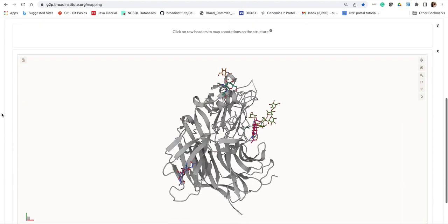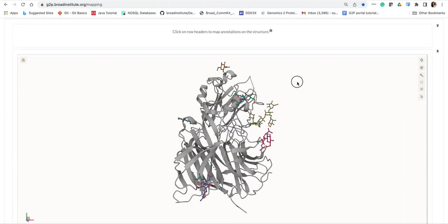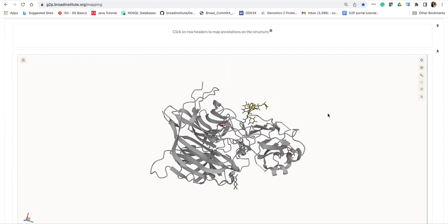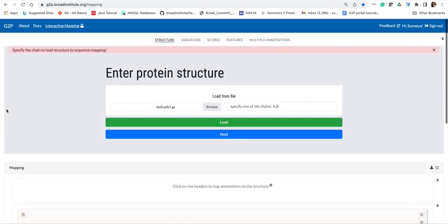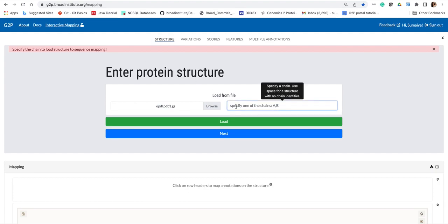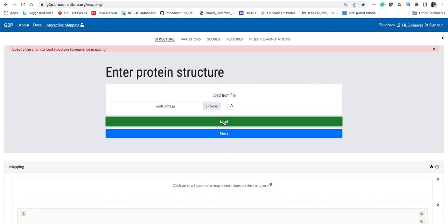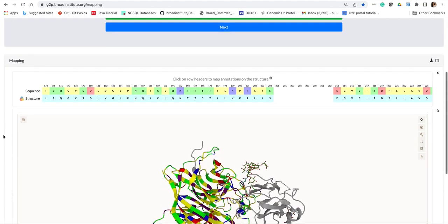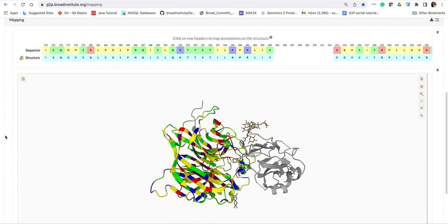Now the structure is loaded here, but because this is a multi-protein complex, the portal will prompt to input the chain identifier that corresponds to the protein that you want to analyze. I know here in this protein-protein complex, chain A corresponds to the viral protein, so I will input chain A and hit load. Then the portal will perform the sequence to structure mapping for you, considering the gaps.